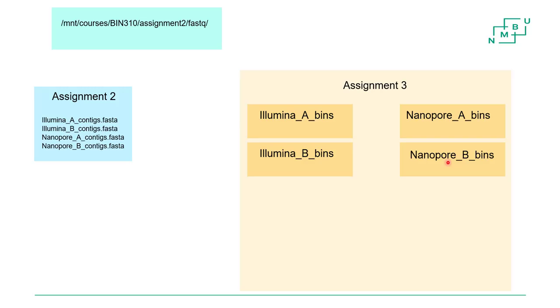And then exactly the same here. And in all 4 cases, you should get this table or this small text file with 4 columns stored separately in each of these folders, right? So after you have done this part of assignment 3, there should be 2 files in here, a contigs file and a small text file with these coverage results, and the same here, the same here, the same here.